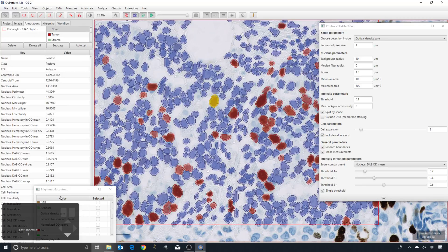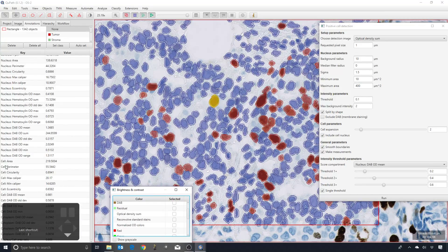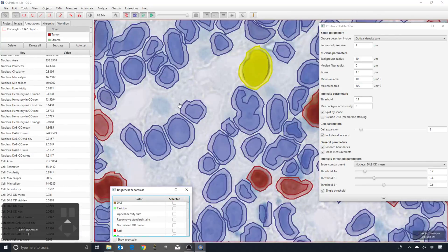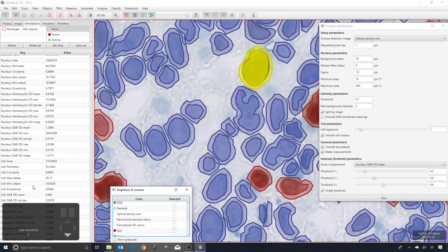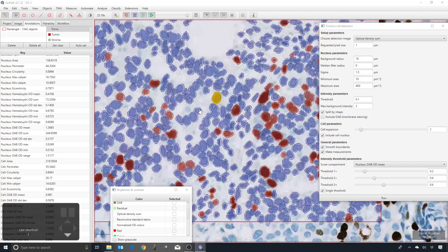For each cell, we get nucleus measurements, cell measurements within the entire outer perimeter, and cytoplasmic measurements, which are just within this ring outside the nucleus.